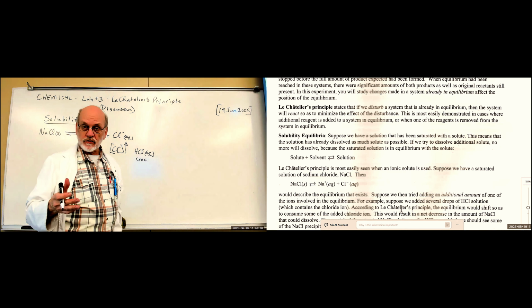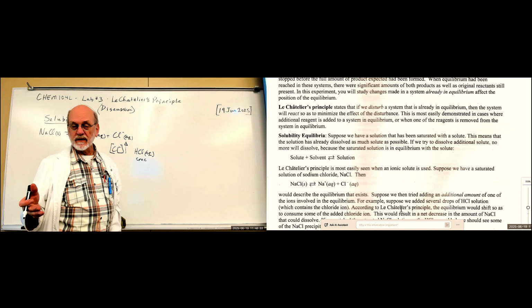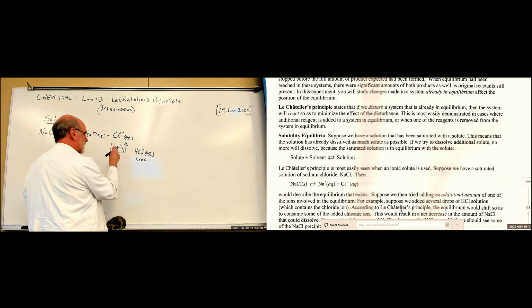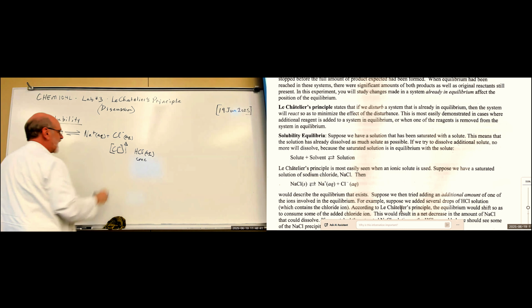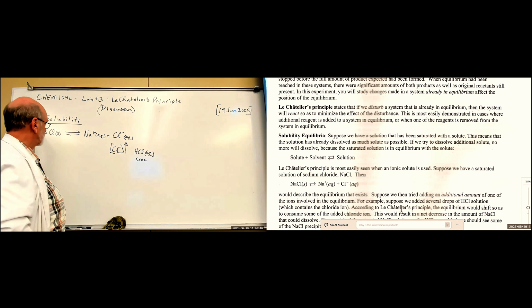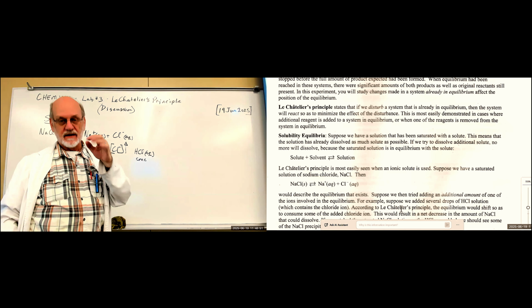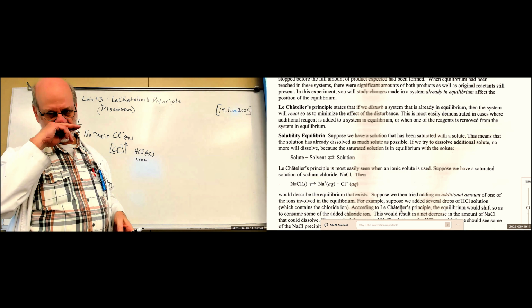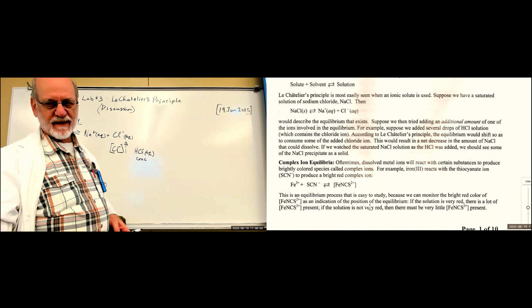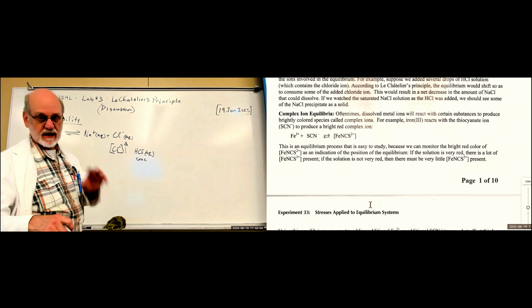If we add a dilute solution of hydrogen chloride, then we're also going to add a lot of water, and we're not changing the concentration. But if we do it this way, we can increase this value. Now, referencing this equation, the reaction is going to move to the left. It's going to produce precipitated sodium chloride, and you will observe that in the procedure.